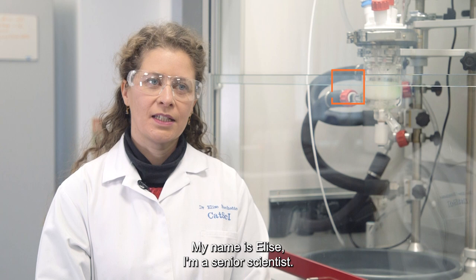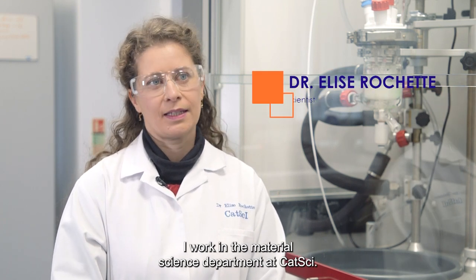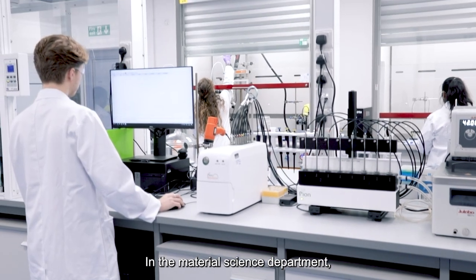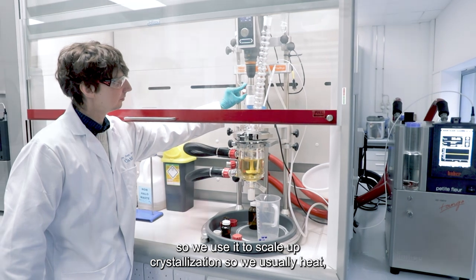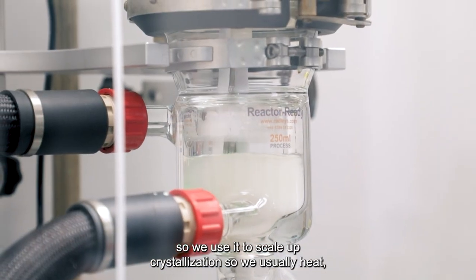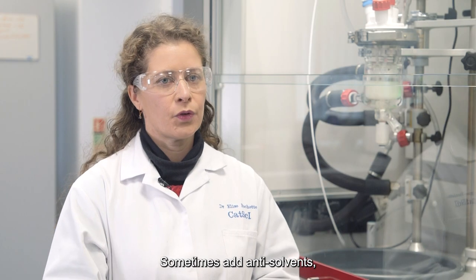My name is Elise. I'm a senior scientist. I work in the material science department at CATSI. In the material science department we mainly do crystallization. So we use it to scale up crystallization. We usually heat, cool, try to form crystals, sometimes add anti-solvents.